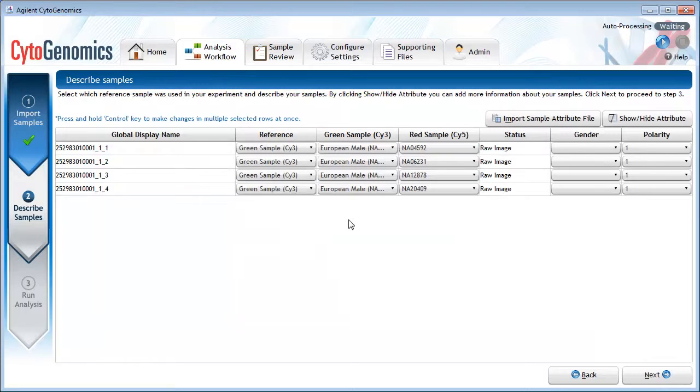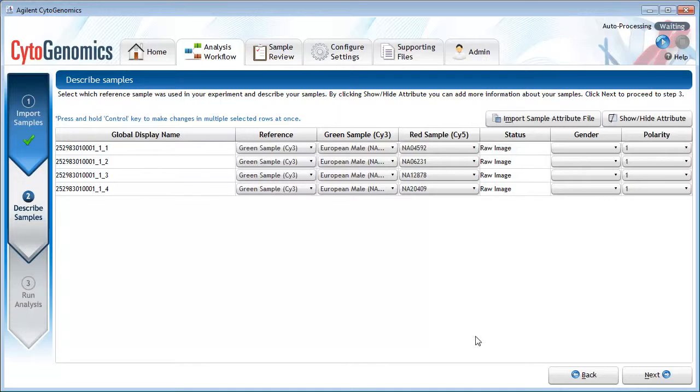And now the attribute columns are populated with information from the file. When you are done describing your samples, click Next.